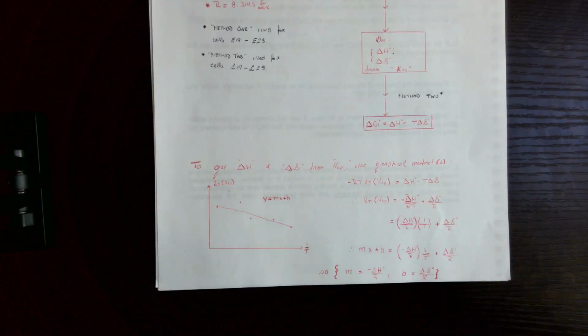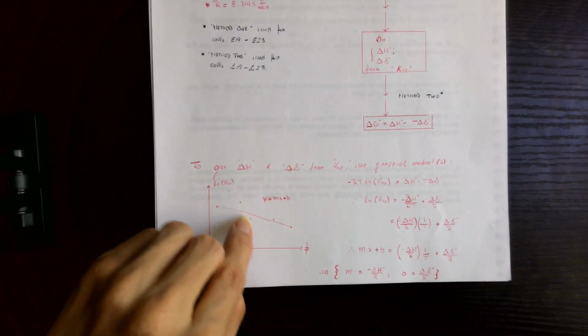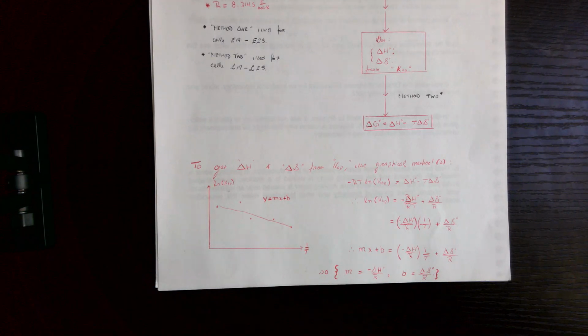Okay, and you should, like I said, get something that's not really much of a straight line. The points are kind of all over the place. You'll do your straight line fit.